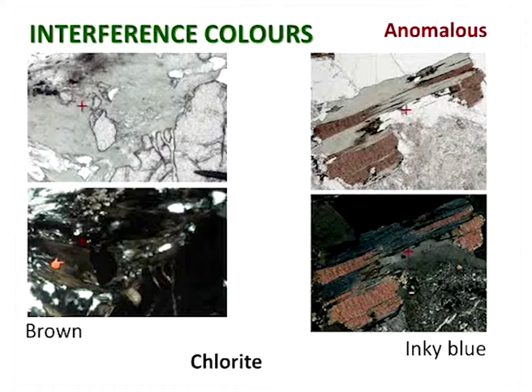But anomalous colours, I said there wasn't going to be any theory, and part of the reason for that is that I don't know most of this stuff very well. So the anomalous interference colours, it's where the colours that you see in cross polars don't match what they should be for the birefringence value of chlorite. So all anisotropic minerals have this birefringence value, which I think is to do with the difference in refractive indices, and that produces interference colours.